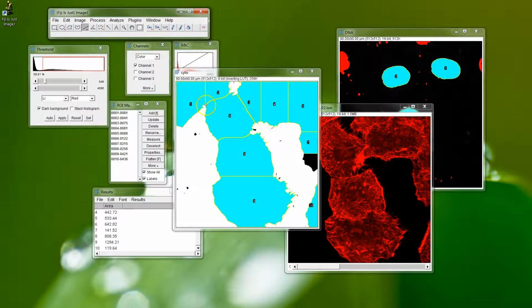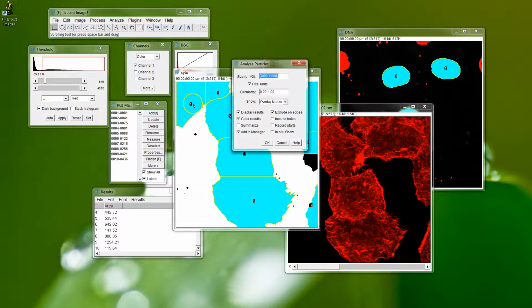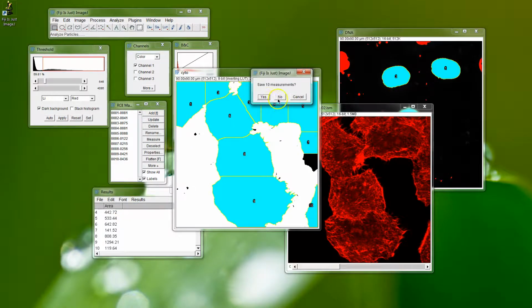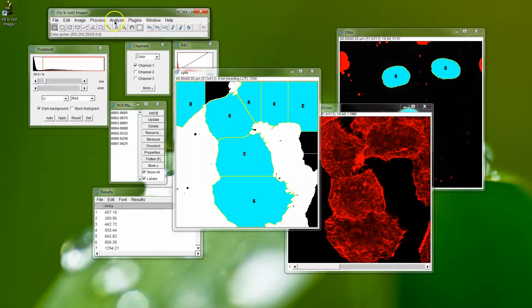You can measure the pixels across somehow. There are different ways you can do that using the selection tools and line profiles. I normally find it's quicker just trial and error. Let's see how we do. So we're starting to lose some of the smaller ones there.